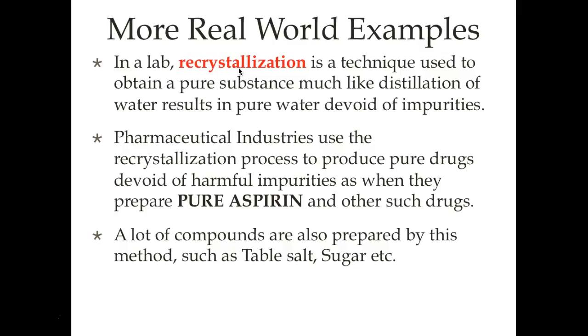So what you could do is take a lot of it and dissolve it into a small amount of water, like 100 ml of water, okay? And then what you would do is a process called seeding, that is putting a tiny little crystal of that substance, the desired substance, into this water solution, which is super saturated. There's too much of the solute in it, all right?